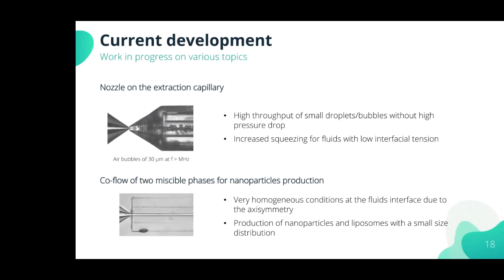So you have to adapt the length of the tubing, the power of the lamp, actually the distance between the lamp and the tubing, to find the good exposure time. The goal in this case is to have the smallest possible tubing to avoid clogging, but to also have good polymerization to avoid coalescence. So it's a trade-off between the power and the length of the tubing.